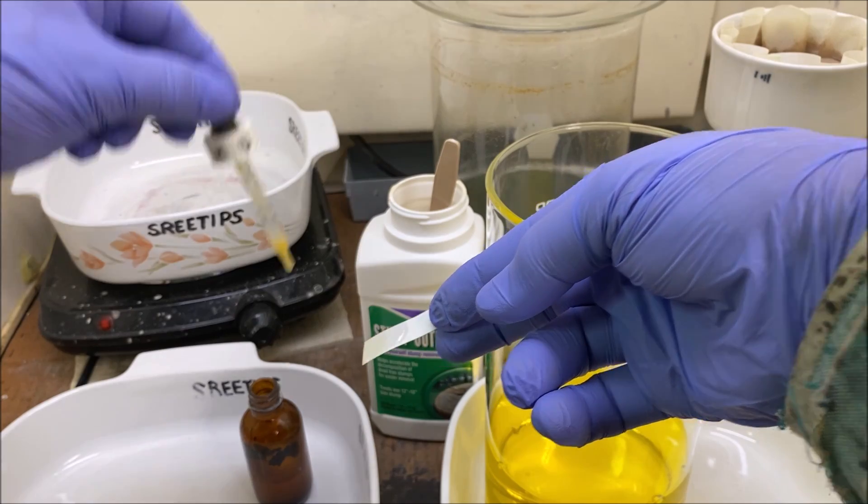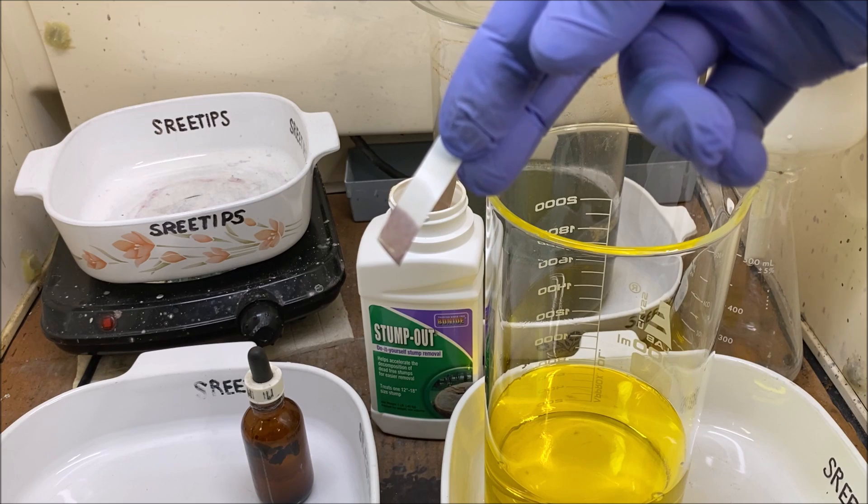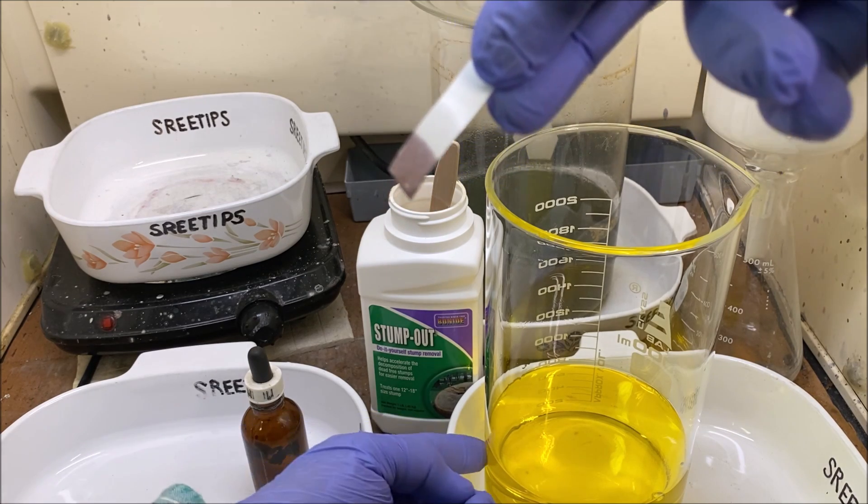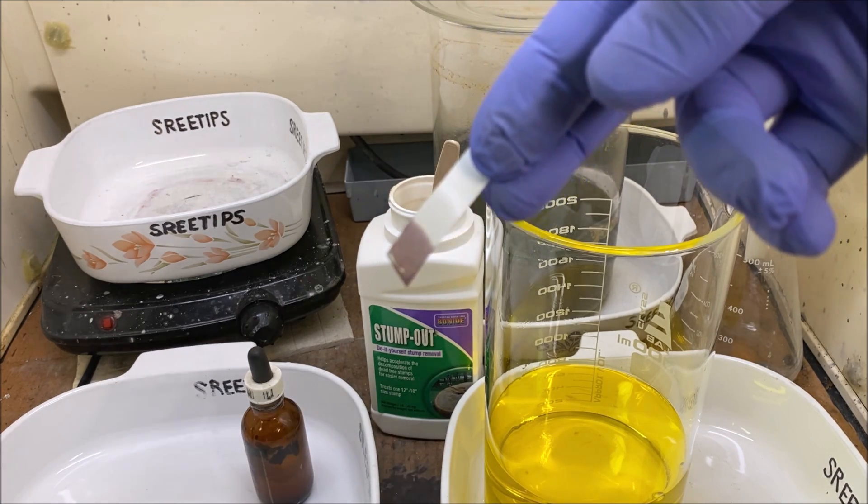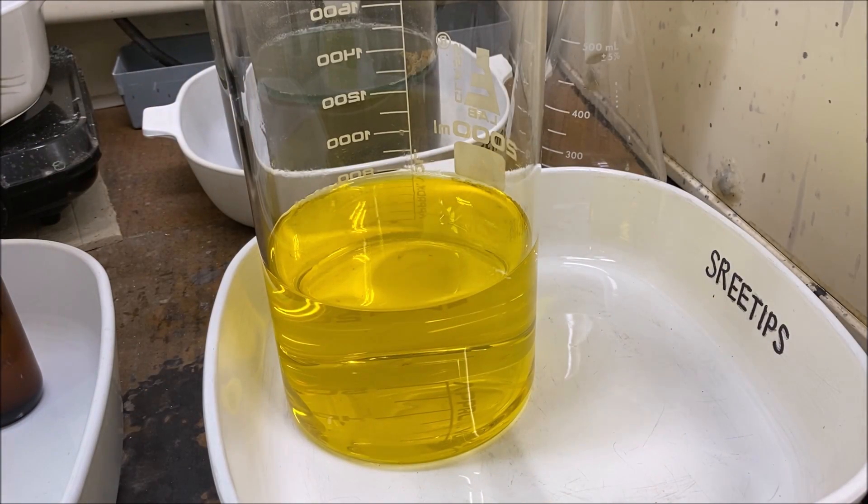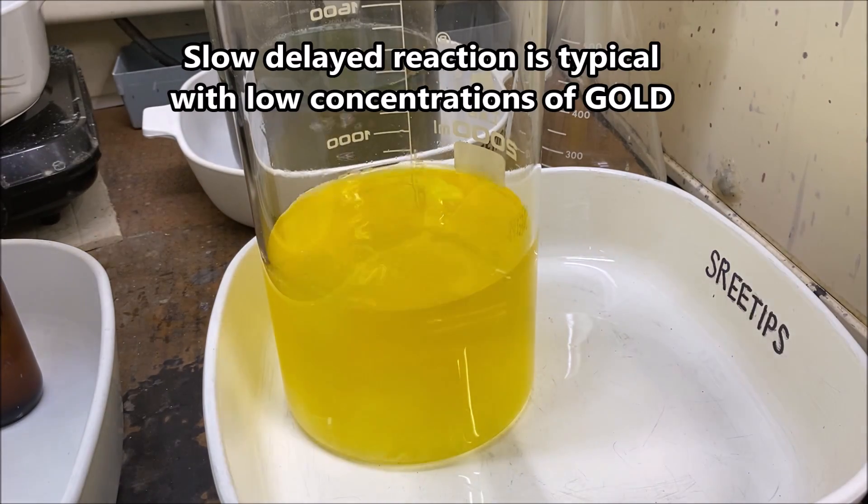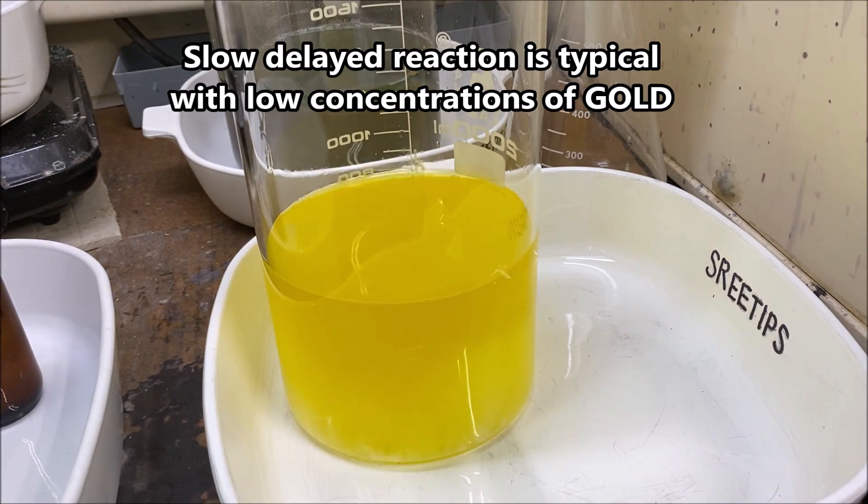Before we try to precipitate it out, that stain tells me I've got gold, maybe a couple grams in this solution. Now we're going to add some stump out which is sodium metabisulfite to precipitate out our pure gold. That should be enough, three spoons should do it.